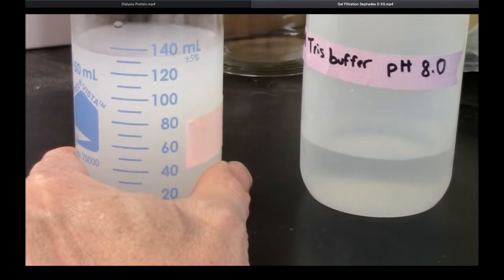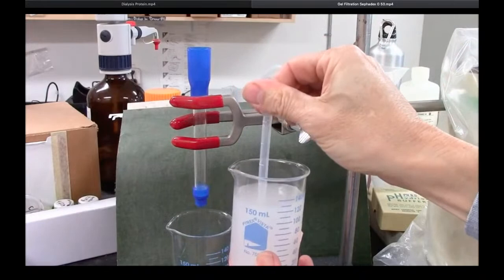So this is making a slurry. I'm using a sawed-off pipette to transfer my slurry to the column.